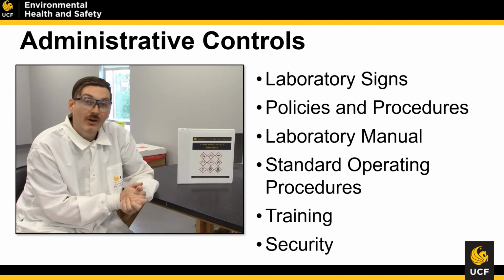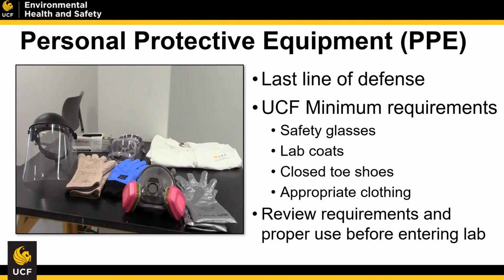So, our last line of defense is your personal protective equipment, better known as PPE. UCF's policies for entering the laboratory require all personnel to be wearing lab safety glasses, lab coats, closed-toed shoes, and clothing that covers the majority of their body.